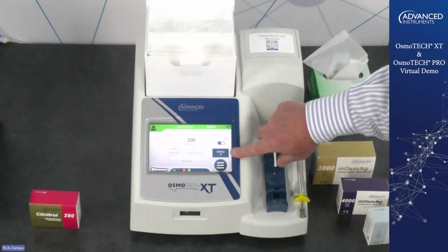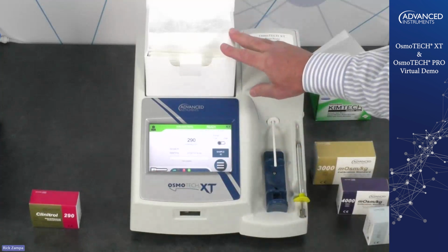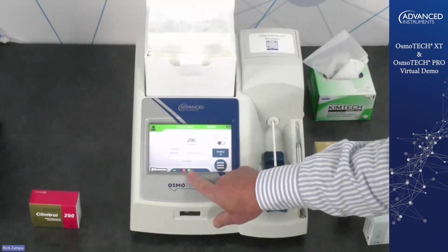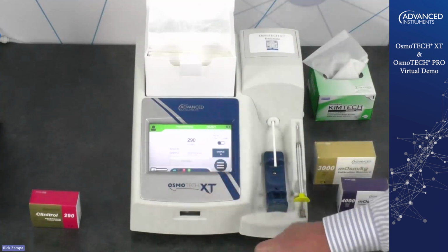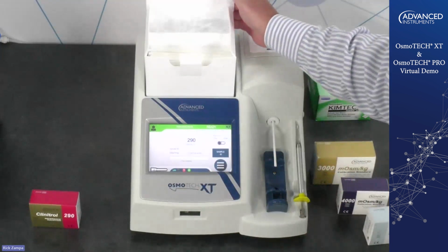Sample ID button here. This is for adding a sample ID to the system. Our menu button, our test counter on this side. It helps you with your inventory control to make sure you know when you're getting low on sample tips and cleaners. We have a couple of buttons down here at the bottom, one for LAN connection, a question mark, which gives you information about the instrument, and then an information button, which gives you further instrument information.